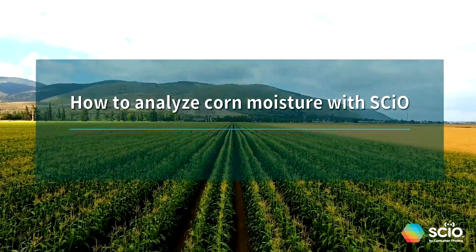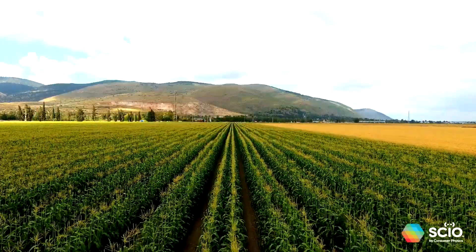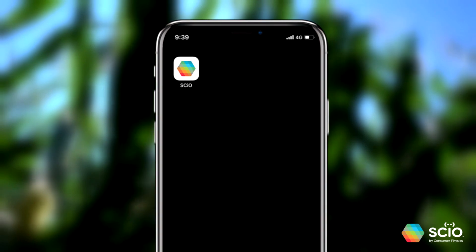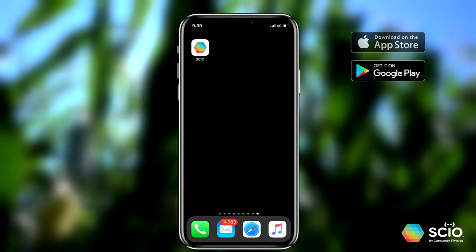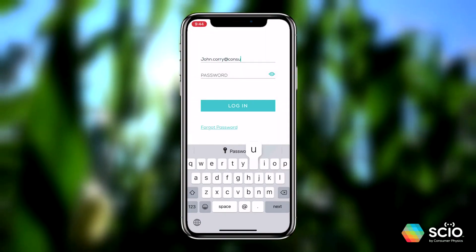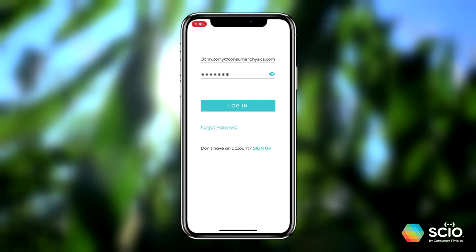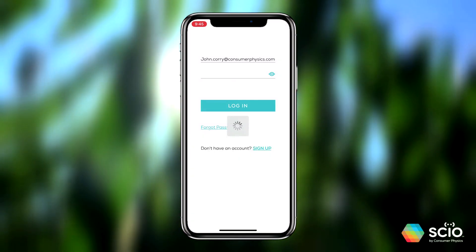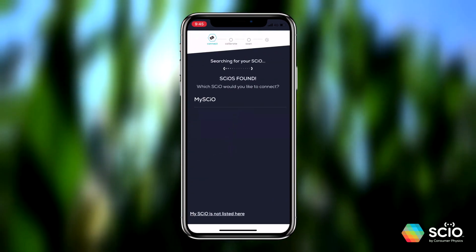This video will show you how to properly scan corn with SIO to get the best results. First, make sure you have the app installed on your phone. Download it from the App Store for iPhones or Google Play for Android phones. Once the app is installed, sign in and pair SIO with your phone. Simply follow the instructions in the app — you will only have to do this once.